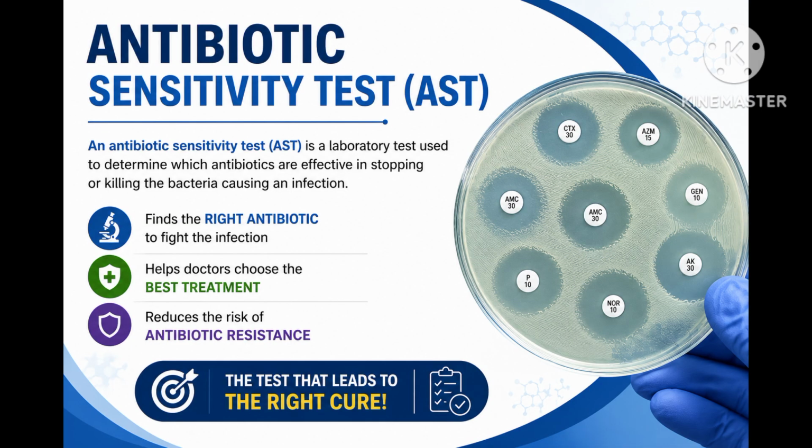An antibiotic sensitivity test is a laboratory procedure used to determine which antibiotics can effectively stop the growth of or kill the bacteria causing an infection. The test helps doctors choose the most appropriate antibiotic instead of prescribing medicines by guesswork.